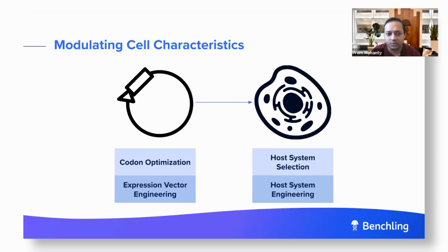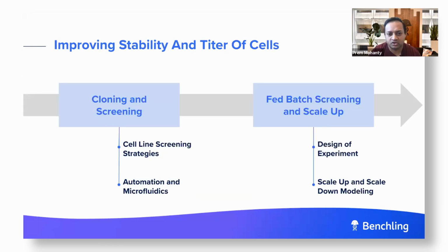And then you have to bring the sequences and the data from these disparate tools into your ELN or registry database to actually do the experiment.